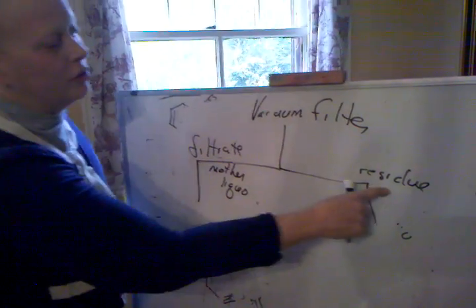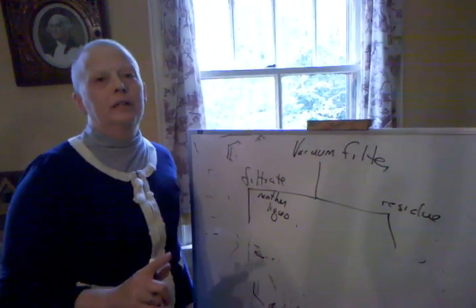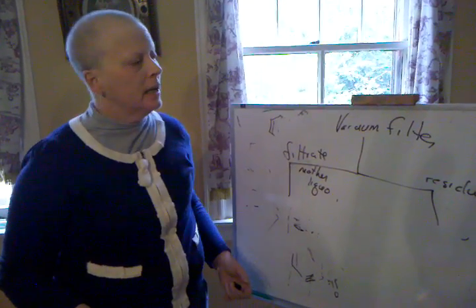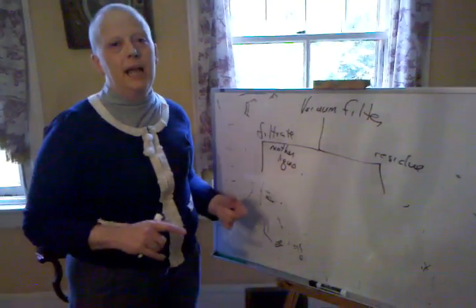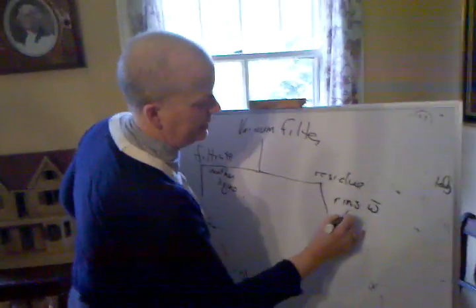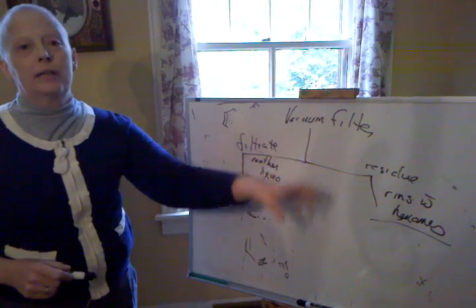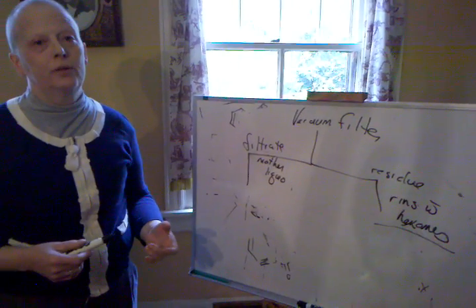Now the question is, what would you rinse this residue with? If you were using a single solvent, you would use the cold version of that solvent, and just a tiny bit of it, because you don't want to rinse your crystals away. If you're working with a system of two solvents, you rinse it with the solvent it is less soluble in. So in this case, you'd want to rinse it with hexanes. Okay? So that's what we're going to do. And then this crystal will take melting points. So hopefully through this experience, you will start to learn how to do recrystallizations. Thanks.